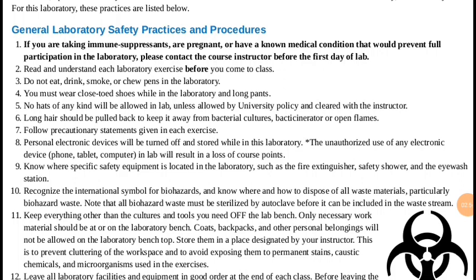Now, before you come to class or to the lab, it is usually advisable to read and understand each laboratory exercise so that you'll be equipped with what to expect. It is usually advisable to use closed shoes, because here we'll be using chemicals, and they could spill and maybe get inside your shoes.